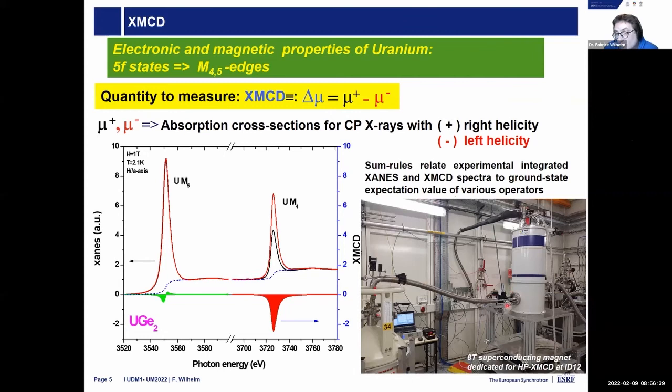There is also a possibility to measure the pressure in situ. One difficulty measuring the pressure in situ is that, as is generally done, the ruby fluorescence system is not close to the cell. We are 30 centimeters from the cell, which is already very difficult and challenging to measure the pressure, but it's actually not a problem.